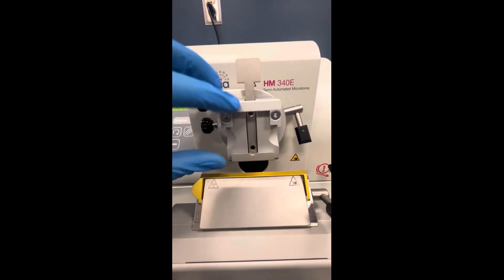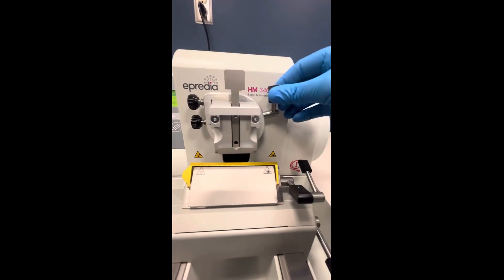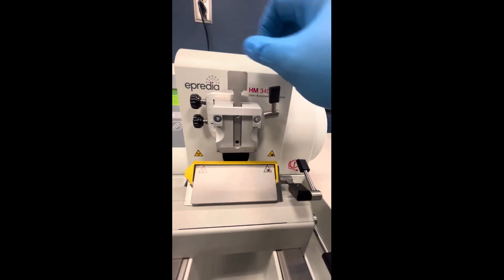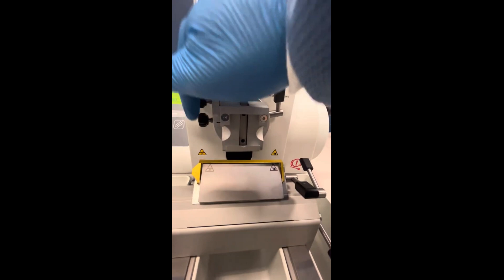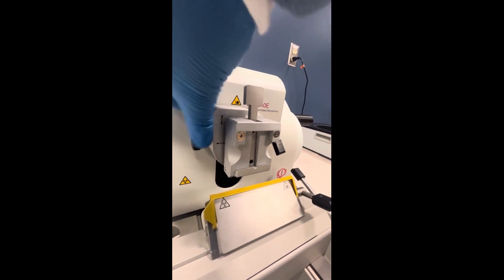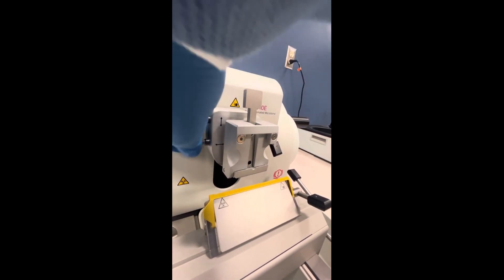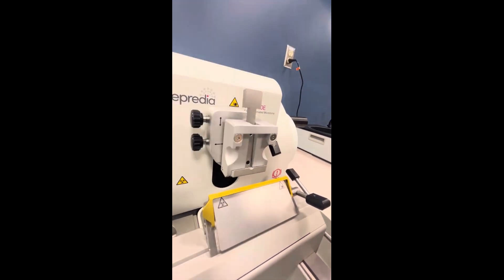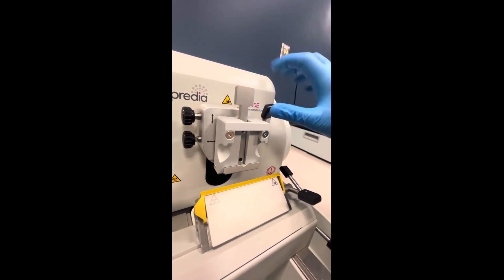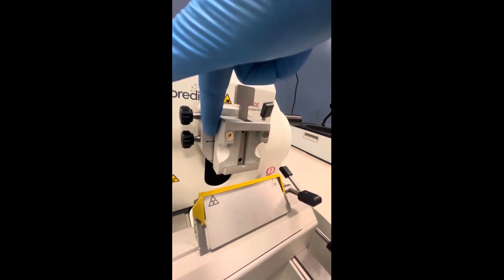Once you have orientated your specimen properly, you want to lock it in place with that lever. Upwards position — the screws don't do anything. Downwards position — they do. Can you see the movement there? It goes from side to side — you're going to orientate your specimen with the knife. Put the lever in the upwards position and that prevents any movement from these orientating screws.